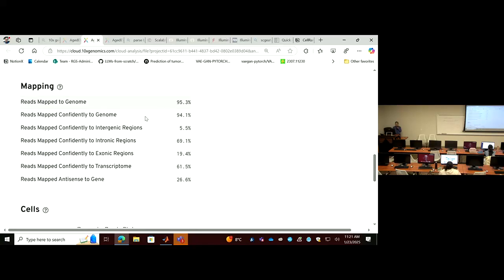Threshold, you mean all these numbers? For the reads mapped to the genome at least? There's no strict cutoff to say I need to be in this or that range. It has to be determined case by case, and those numbers change quite a lot.